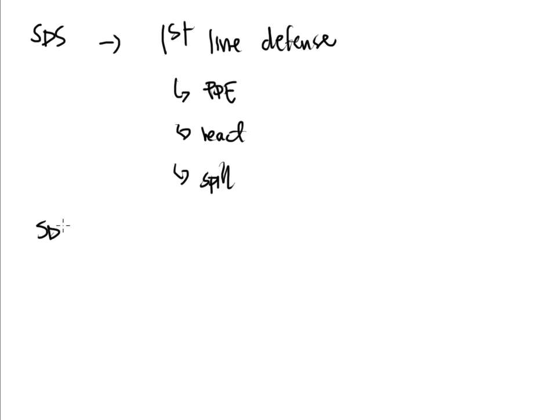We also said that the SDS has a tendency to overstate hazards. We saw that in a way with the water SDS that we covered in the previous video. Yes, they make these full-blown statements. I know that I should wear safety goggles and a lab coat when I use water, but does that really make sense?